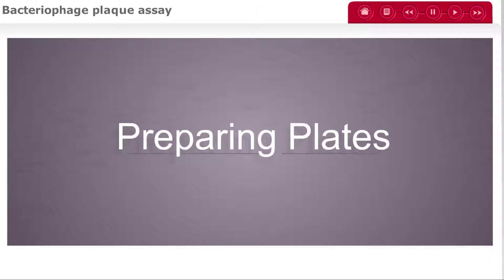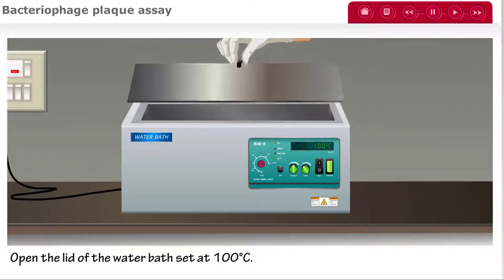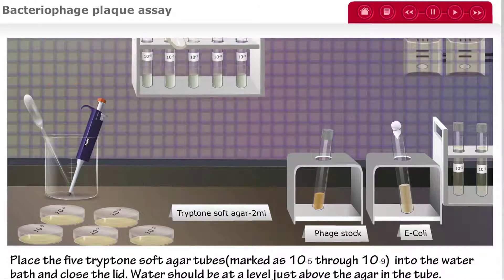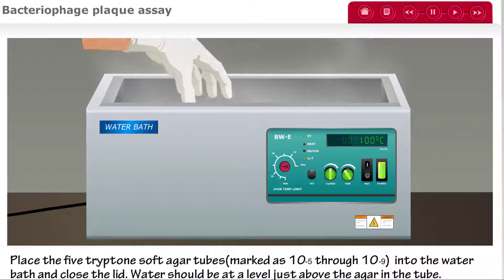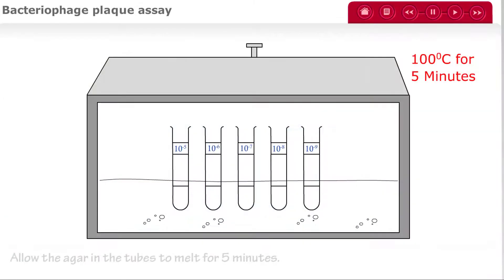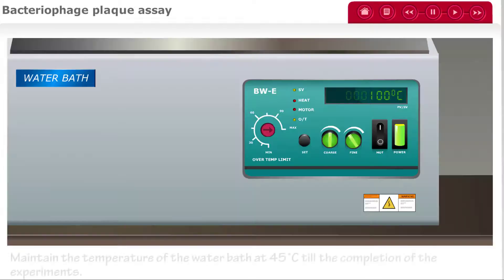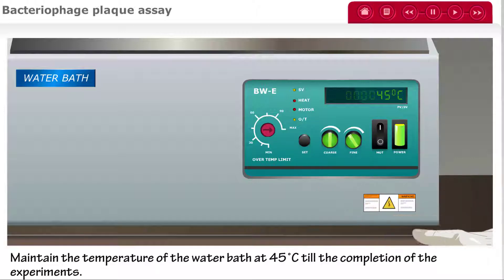Next, we will prepare our plates. Open the lid of the water bath and set the temperature to 100 degrees Celsius. Place 5 tryptone soft agar tubes marked 10 to the negative 5 through 10 to the negative 9 into the water bath and close the lid. The water should be at a level just above the agar in the tubes. Allow the agar to melt for 5 minutes, then maintain the water bath temperature at 45 degrees Celsius until the completion of your experiment.